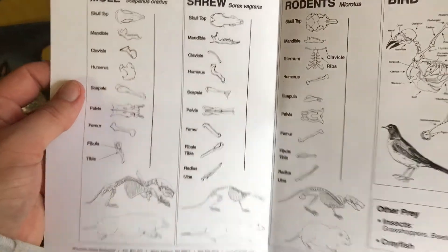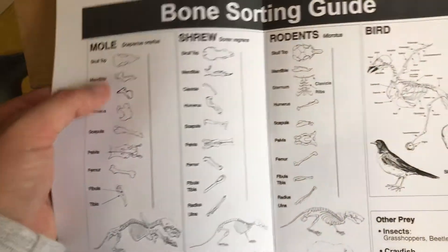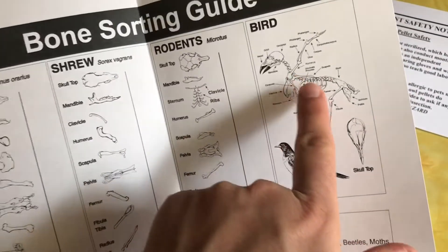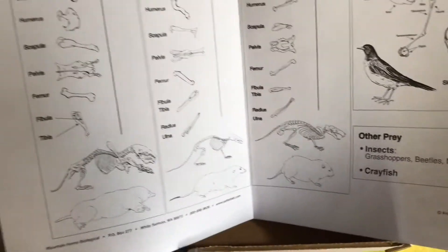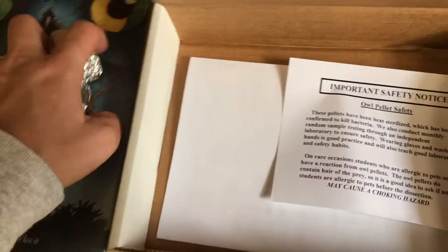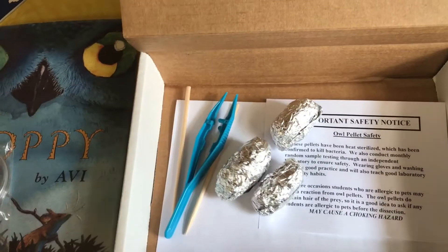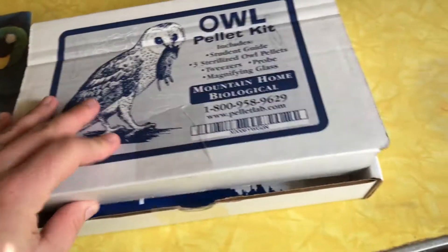There's also a bone sorting guide, so as we dissect we'll be able to pick out the bones and sort them into moles, shrews, or different kinds of rodents. We might find some bird bones too, since owls eat small birds as well, or insects. That'll help us as we're dissecting everything and sorting it out. I'm going to put this all back in the box, and I will record us picking some apart and identifying the bones — and then let y'all know what my kids thought of it and if we liked it.